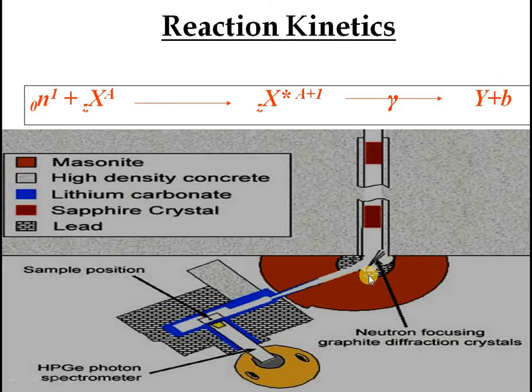As you already know, this is the typical schematic of a neutron collision reaction. A neutron impinging on the nucleus of analytical interest excites it and its mass number changes, resulting in the emission of a gamma ray. It is not mandatory that only one gamma ray is always emitted. Two gamma rays can be emitted, three can be emitted.